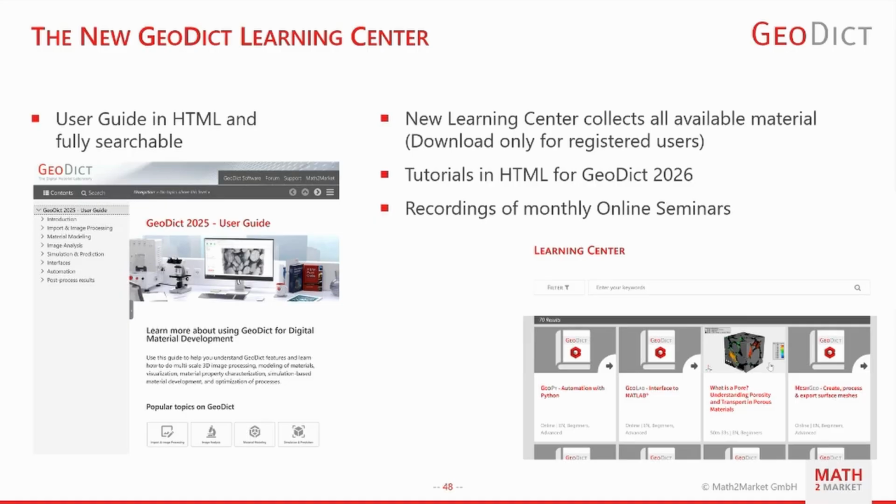And yeah, in the past slides, I have shown many new features in the upcoming 2026 version. And we have invested not only effort into developing new features, but also in improving the documentation and creating some training material. We have in the last year converted the user guide from PDF documents to an HTML website. And this allows much easier search through the whole document.